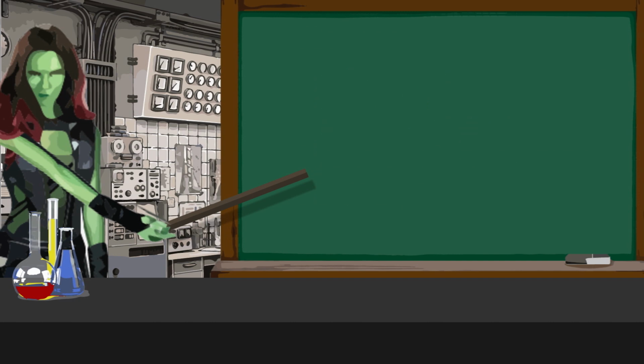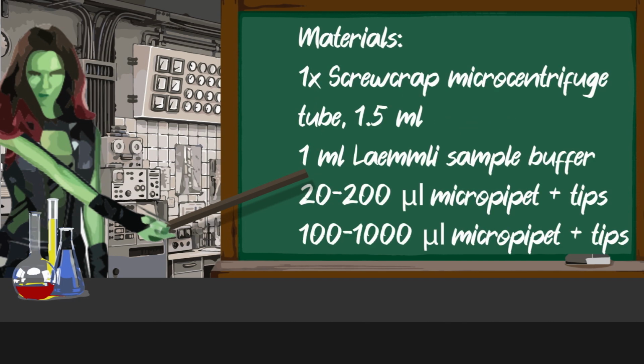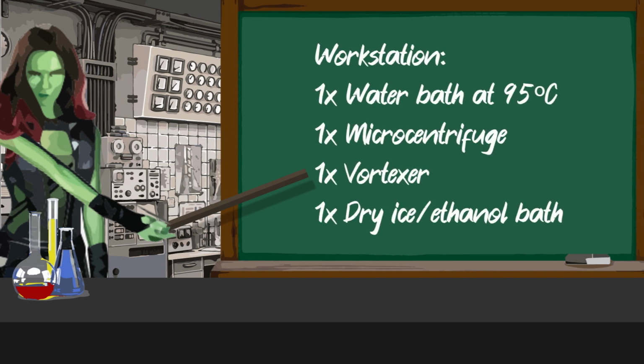You need a screw cap microcentrifuge tube, 1 milliliter Laemmli sample buffer, 20 to 200 microliter adjustable volume micropipettes and tips, and a pen, and a water bath at 95 degrees Celsius, and a microcentrifuge with variable speed settings above 16,000 Gs. You'll also need a vortexer and a dry ice bath.